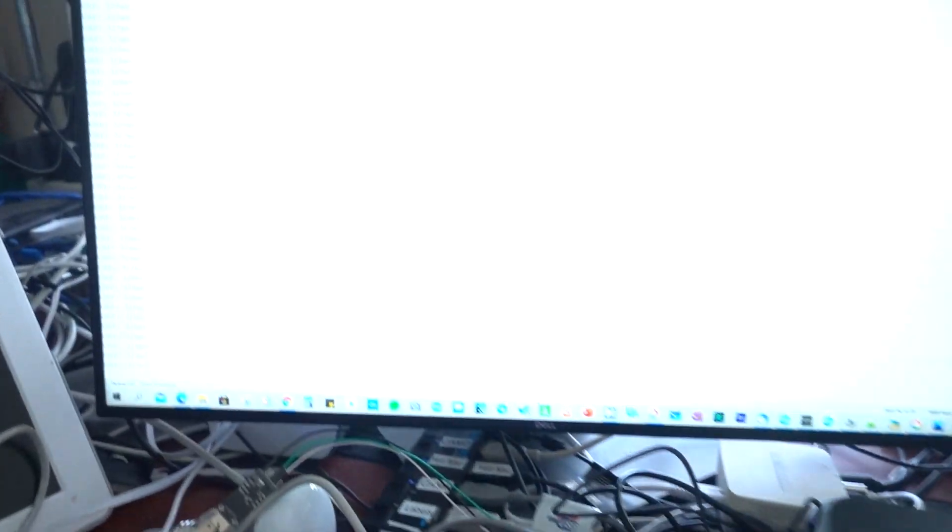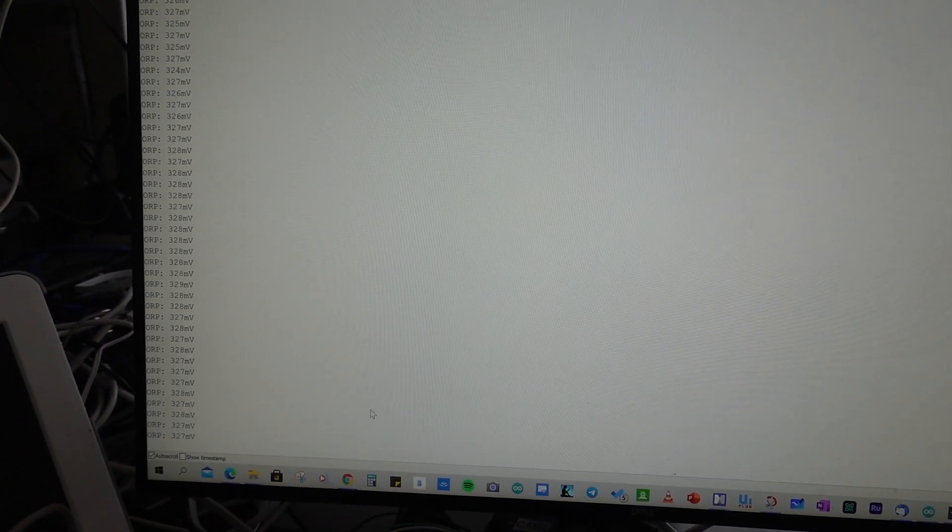We can have a look at that. We'll go to my PC which is connected via serial port to the Arduino mega, and you can see the results here around about 227 millivolts. That's in dry air.